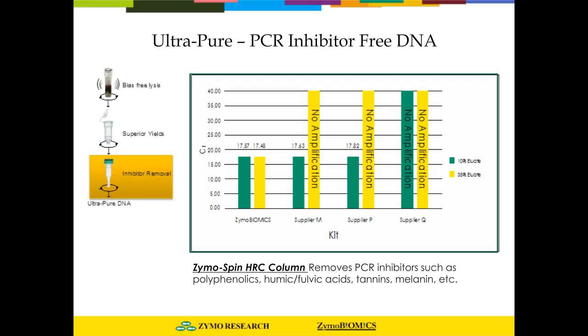And what we're looking at is basically a standardized input of everything using a plasmid. So all the cycle numbers should actually be identical, and then we increase the amount of eluate present, and as the eluate increases, if there are many inhibitors present, you'd expect to see the inhibition increase or no amplification. With the ZymoBIOMICS kit, you see that the sample remains at 17.5 cycles approximately, and supplier M and P, they're still good at about 10% of the eluate. However, as you increase the amount of eluate, you notice that the samples become completely inhibited.